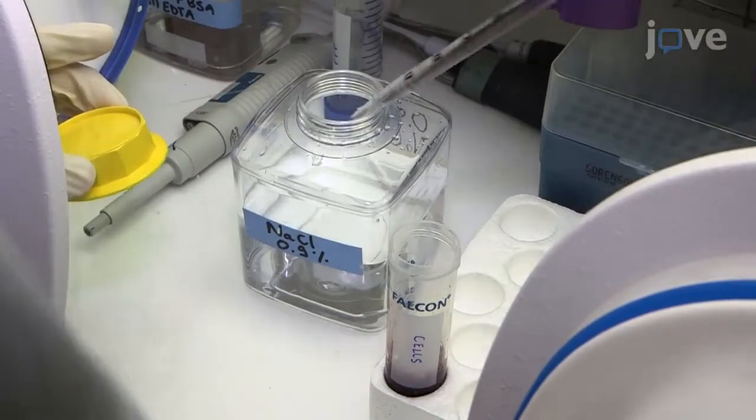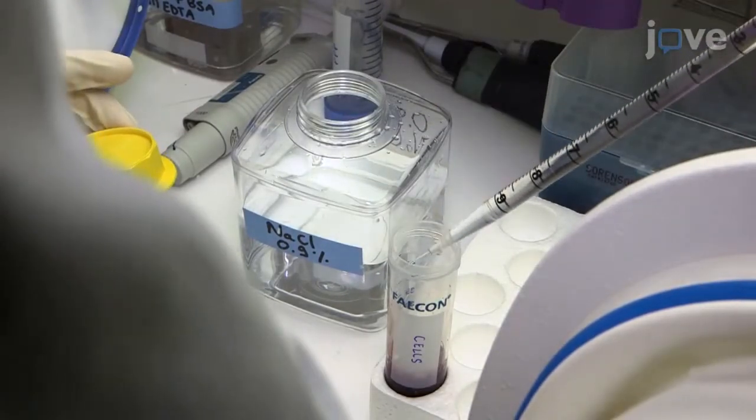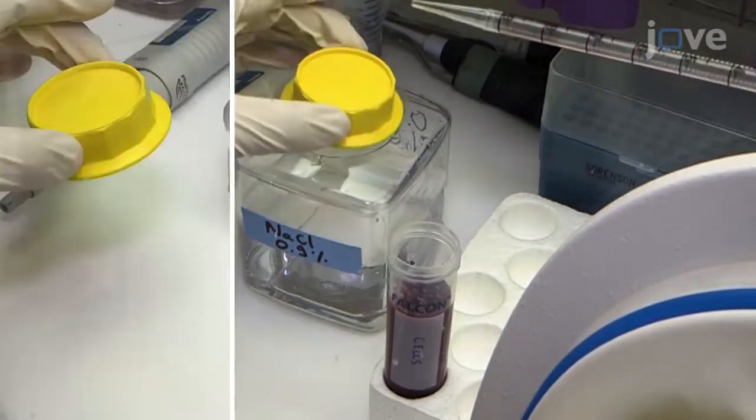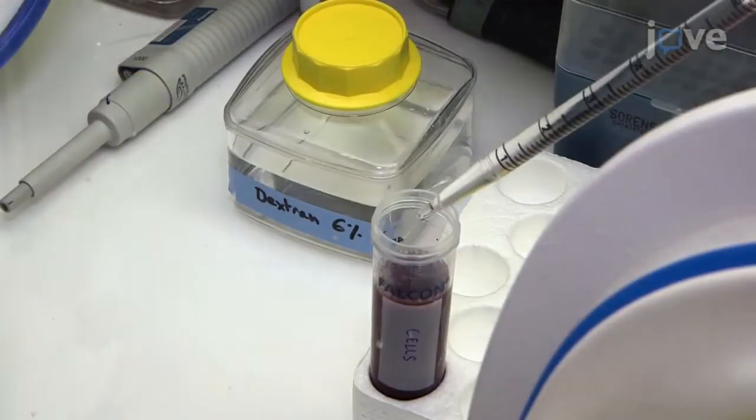Then, add 0.9% sodium chloride solution until the total volume reaches 44 mL, and add 6 mL of 6% dextran.